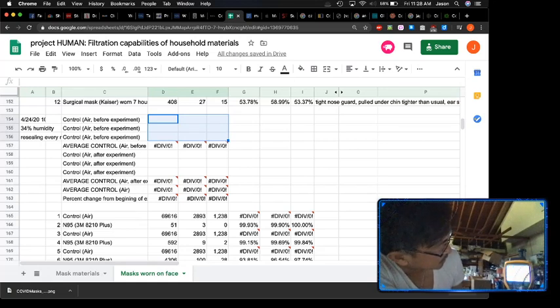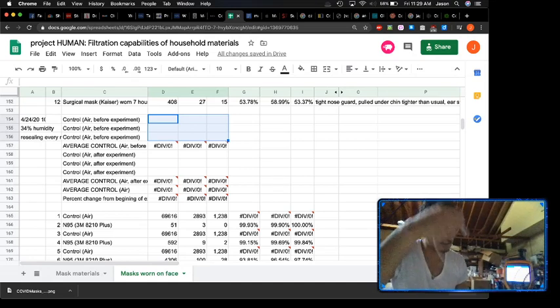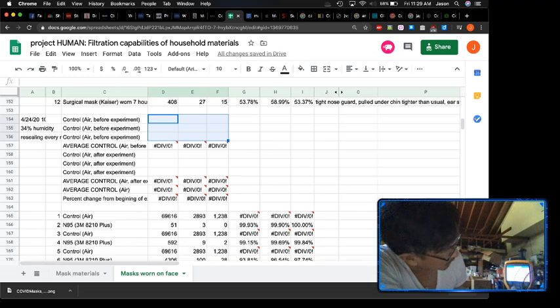Okay. All right. So this is going to be a new test setup with different parameters. So I'm going to change the test data, sample setup, volume, go down to 1 liter, delay of 10 seconds to make sure all the air from the tube is sucked out before the actual value, the air that's going to be counted, happens.